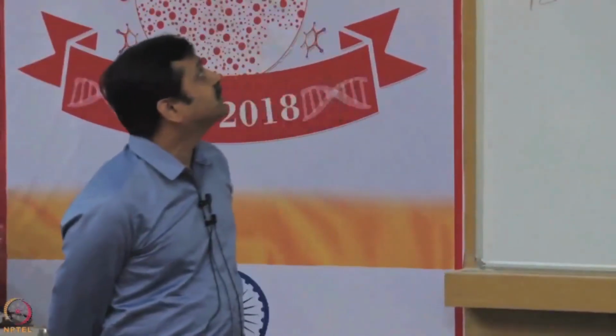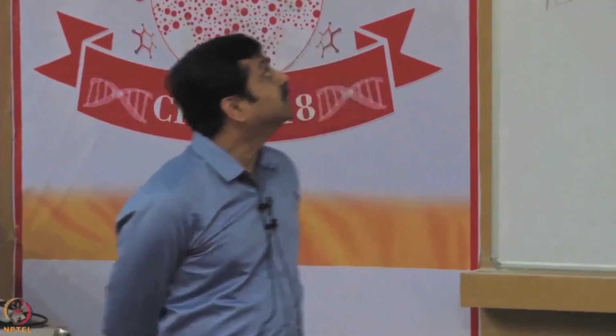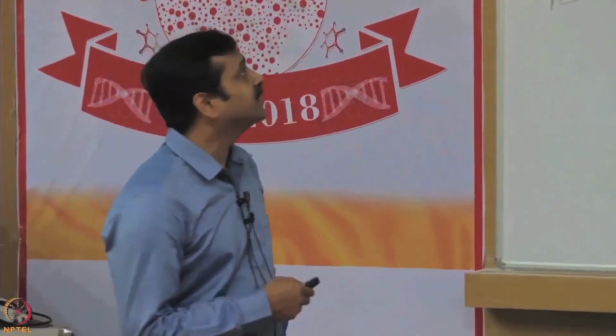The topic I chose today to share with you is an integrative proteogenomics approach to unravel human proteoforms. So, this title has three terminologies which need attention. One, of course, proteogenomics, the conference is on that. The second one is proteoform. We will try to understand what these proteoforms are. And the third is the integrative approach, which is what I mostly work on, so my major thrust will be the approach by which we identify the proteoforms.